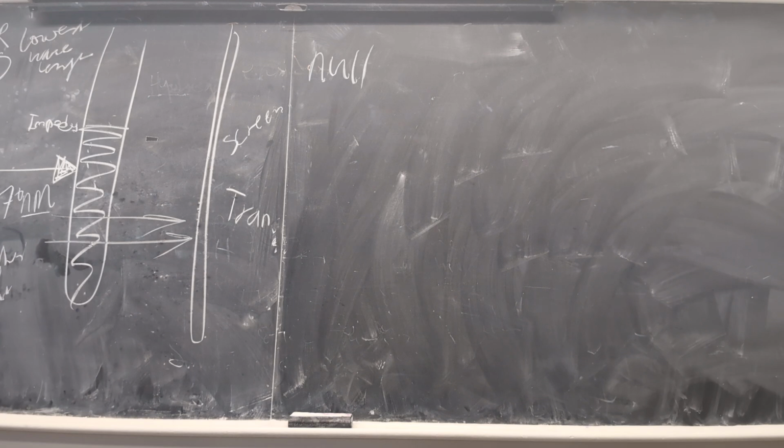All right, guys. Yes, what were you asking? Jonathan said Christopher, the rest of them are good. Why is it off? You need to make sure that you turn it on. Let me turn it off. How many drops of water? It's not the drops of water, it's about a whole milliliter of water. So we have to add a little bit of water every time. Just add a milliliter of water.